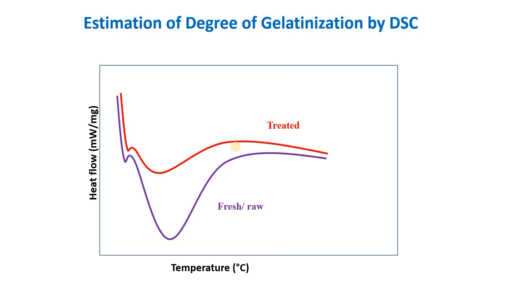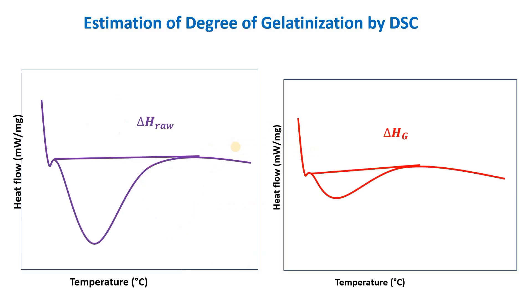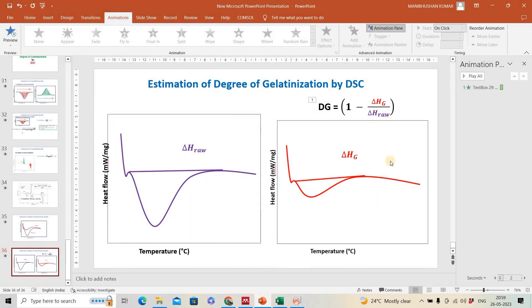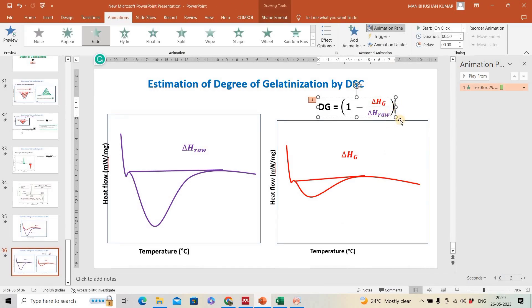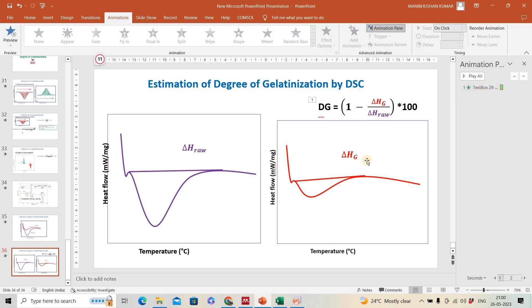To calculate the degree of gelatinization, we use two DSC graphs — one for the fresh sample and one for the treated sample. We calculate the separate enthalpy of gelatinization for each, then use the formula: degree of gelatinization equals one minus (enthalpy of treated divided by enthalpy of fresh), multiplied by 100 to express it as a percentage.